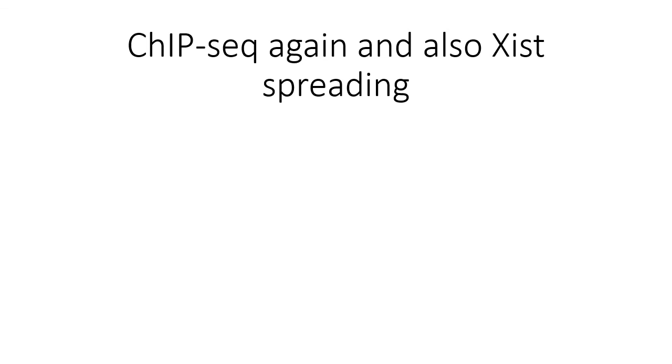Okay, today we're going to start with our worksheet which is about ChIP-seq. We did go over this briefly last time, but I think it was kind of fast, and another example certainly won't hurt. And then we want to talk a little bit about Xist and how it's believed to spread along the length of the X chromosome.